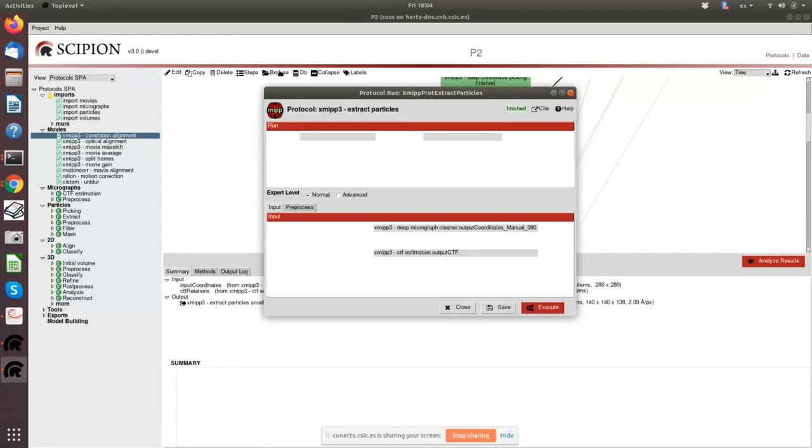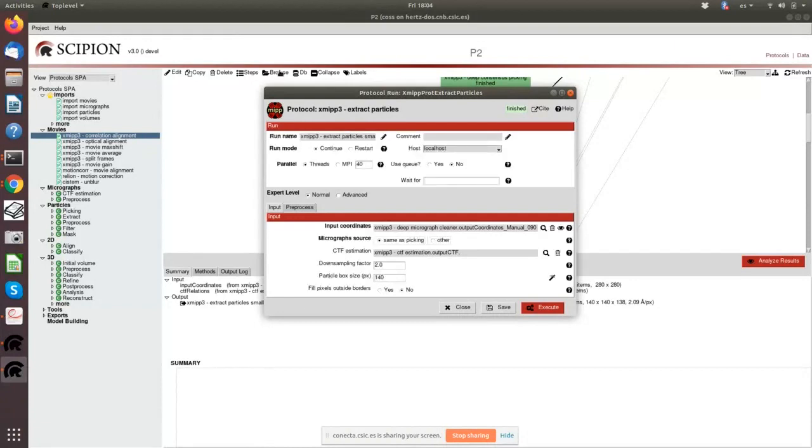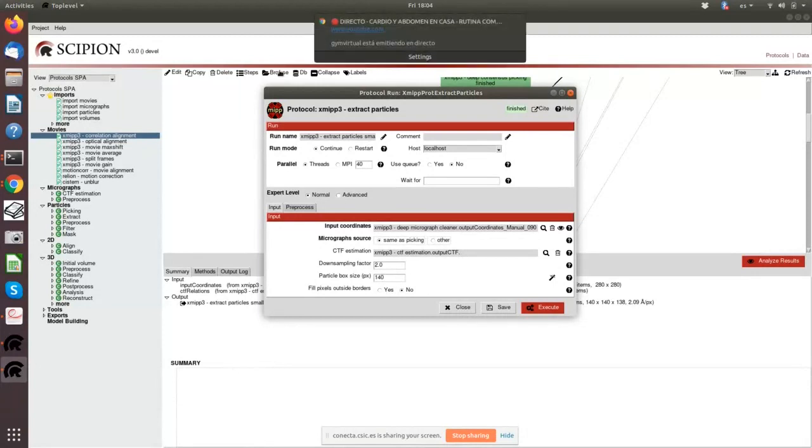And convolution means that if you want to deconvolve, you need to know how the surrounding of a particle is, so that you can incorporate that information to perform a proper deconvolution. If you have very tight particles, very tight boxes, then you are missing that information. But it is not a total catastrophe.